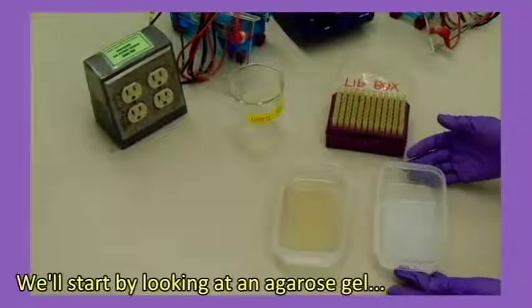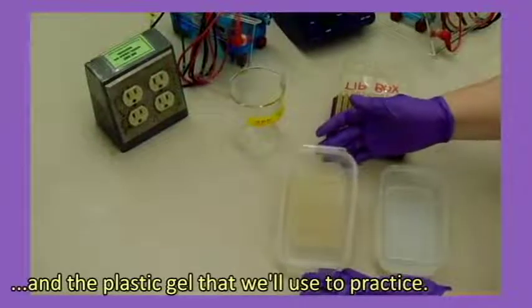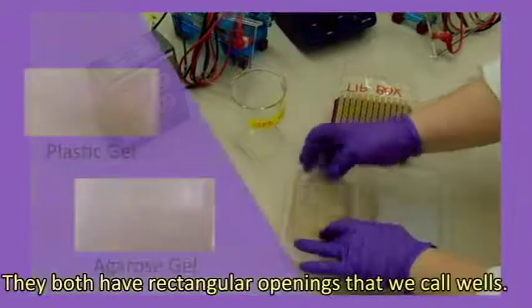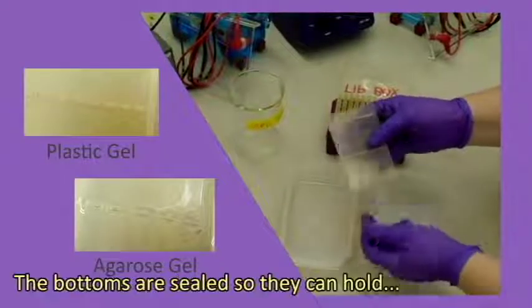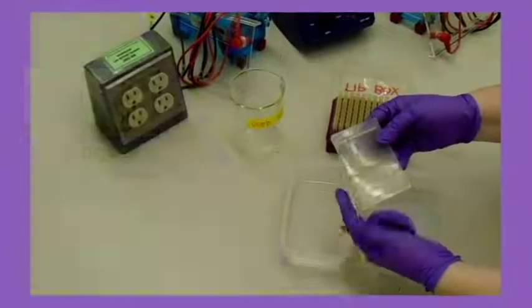We'll start by looking at the agarose gel and the plastic gel that we'll use to practice. They both have rectangular openings that we call wells.